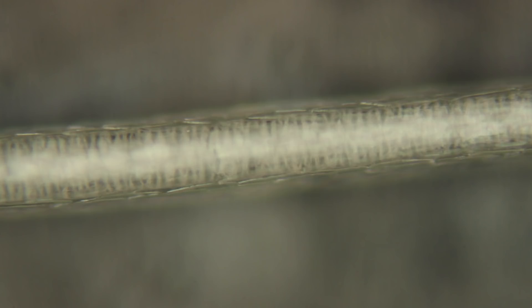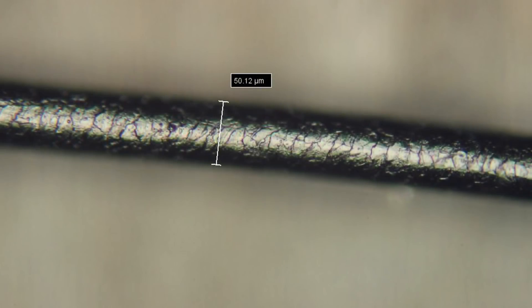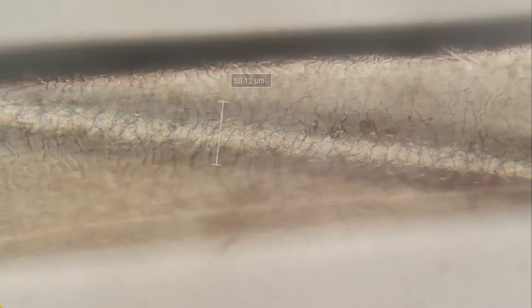Arctic fox hair has a distinguishing feature: at the base you can see really spiny scales, which is very different from coyote hair. The scales in foxes tend to be spinous toward the base, and fox hair tends to be visibly shorter than wolf or coyote. Distinguishing dog hair from coyote or wolf can be tricky, especially with breeds like husky or malamute. Dog hairs are usually unbanded with pigment extending all the way to the root, and they don't have the spiny scales seen at the base of fox hair.